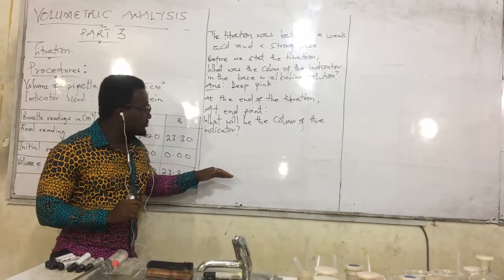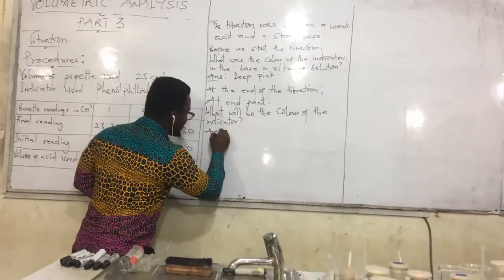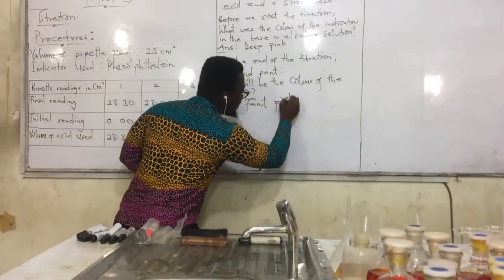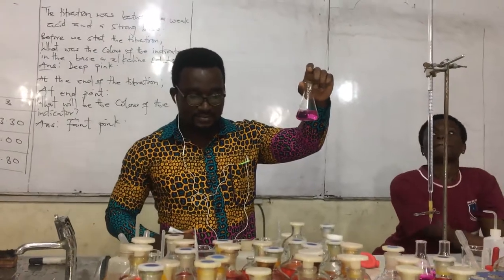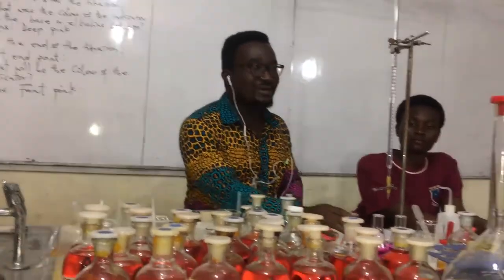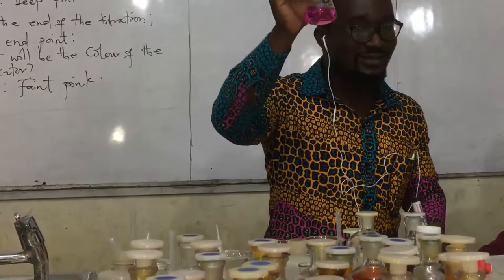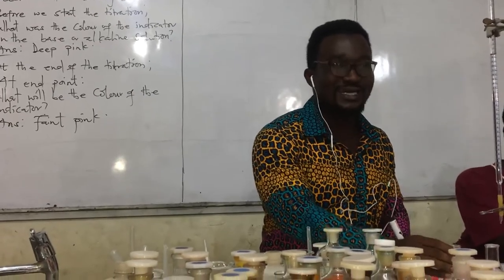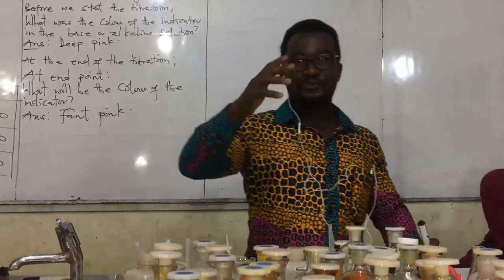So, what will be the color of the indicator at endpoint? Answer: faint pink. See, the color faded. It was deep. It is faint. Now, a single drop will lead me to a colorless solution. A single drop within this will lead me to a colorless solution. It doesn't mean that the solution must be colorless.